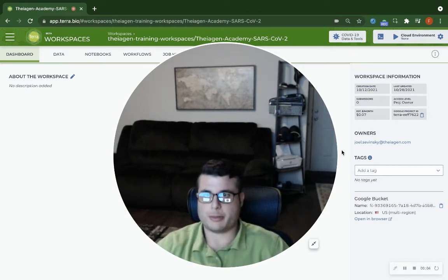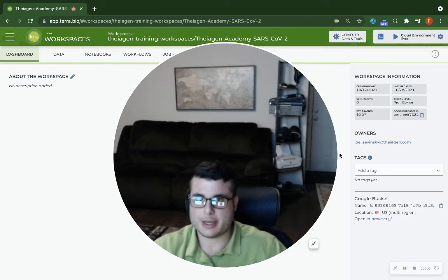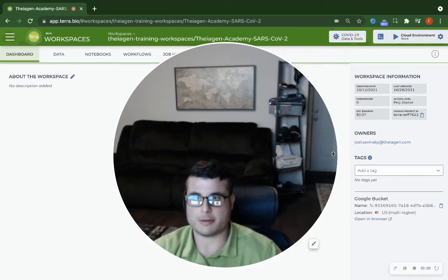I'm Frank Ambrosio, a bioinformatics scientist with Theiagen Genomics, and in this video, we'll be going over the process of running the Illumina Titan paired-end genomic characterization workflow on Terra.bio.